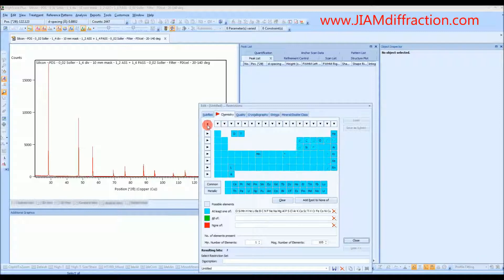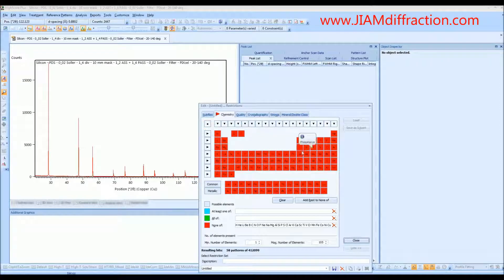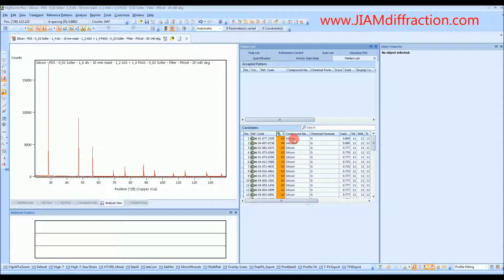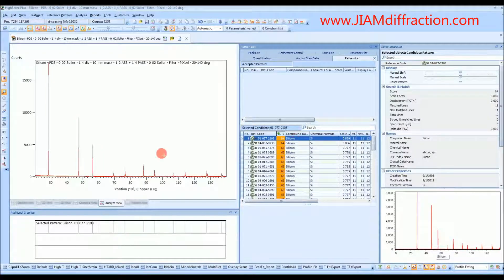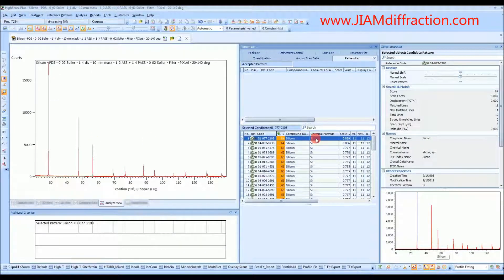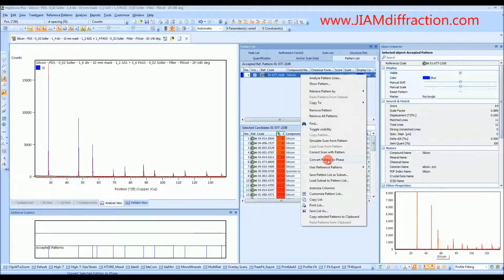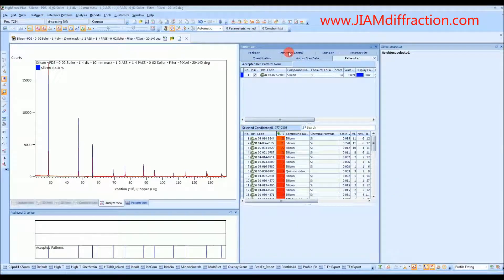If you click this little button here, it cycles all the elements through the colors, so I will change them all to none, and just choose silicon as the only possible element, and that brings us down to 155 patterns to search through. I'll close and search, click on the first candidate, and we see that the bluish-grayish lines match up nicely with our diffraction data. Even the relative intensities are pretty close. So I will left-click and drag up, and then right-click and convert pattern to phase.